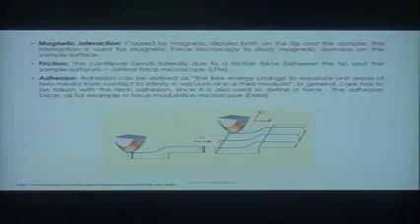Adhesion, right? So if you want to make a surface that sticks better or worse than something, let's say that I was interested in how well two materials stick together at the atomic level. Well, what I would do is on my AFM tip, I would put one of my materials, and on the substrate, I would put the second material, and I would study that interaction. Okay? So there's a lot of degrees of freedom that you can do as an experimentalist with atomic force microscopy.